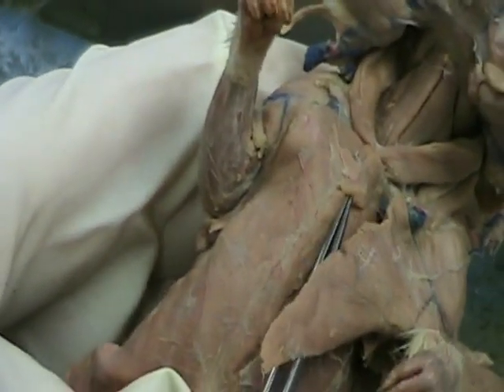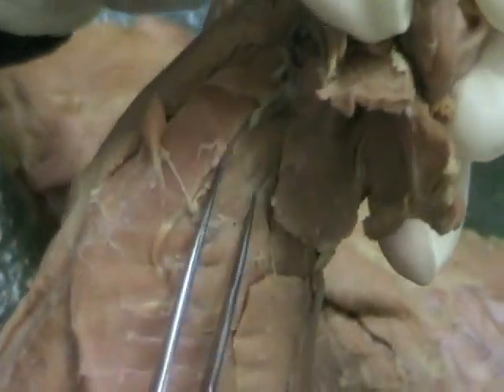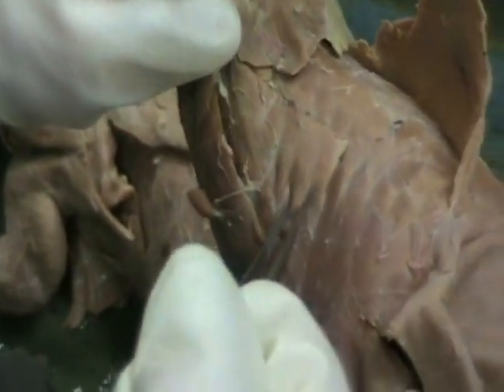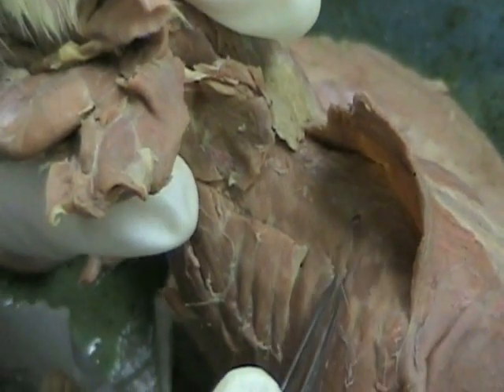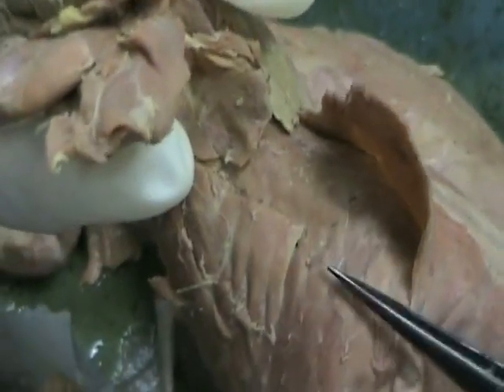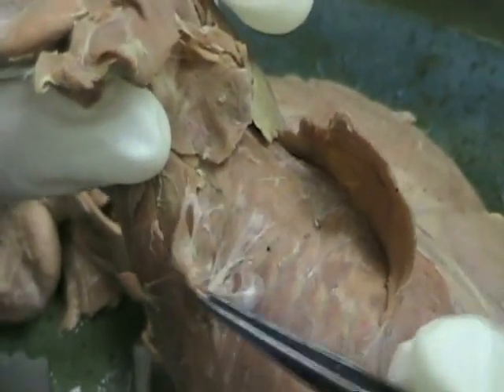If we open up the pectoralis, we will see inside a very skinny, thin rectus thoracis. This is the rectus abdominis. And behind that you have scalenus. Remember, serratus are ones that have serrated appearances because they insert into ribs. So here are the serratus ventralis. You can see that the points are located ventrally relative to these serration points up here. Let's see if I can't mutilate it. Do you guys see these up here? These are definitely more dorsal. Okay. So this is the serratus dorsalis. This one that's been cut right here is the serratus ventralis.